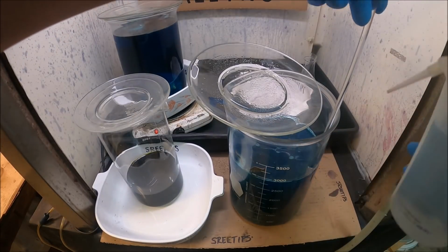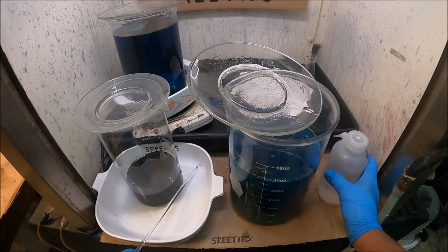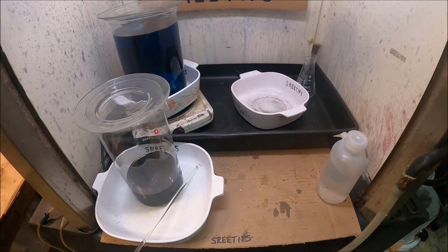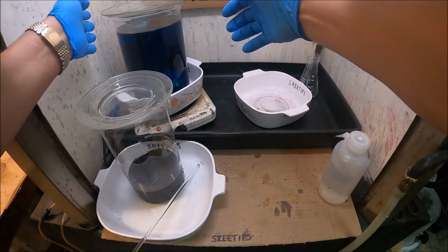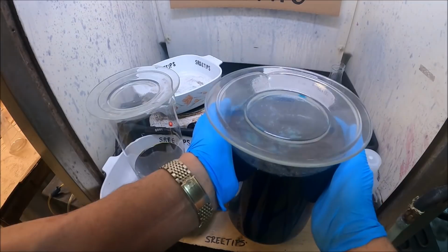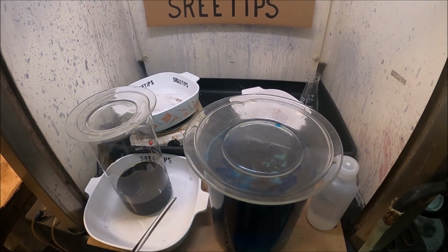When we get these metals out of solution and take a look at them, they normally look like there's a lot more than we think when they're in the beaker. And then when we get them down and actually look at them, there's a lot less than we are expecting.